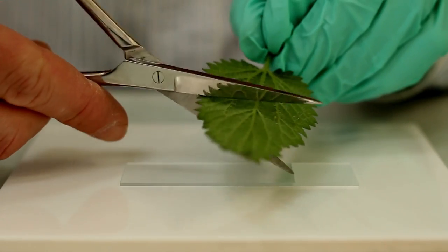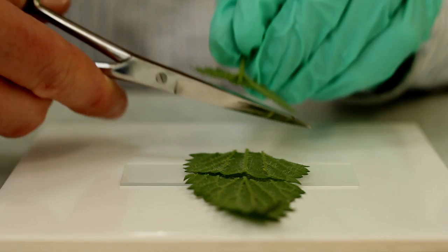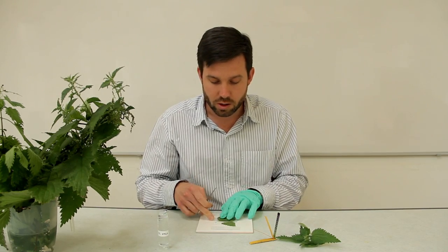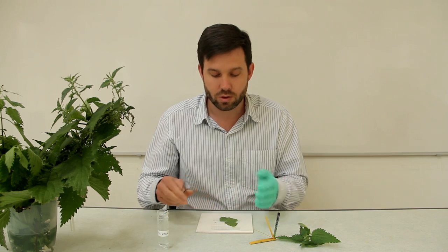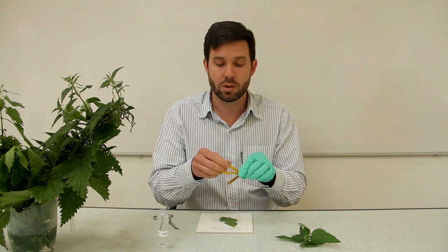You take a slice of your stinging nettle leaf on your slide — and I'm wearing gloves to do this for obvious reasons — and you put the lowermost surface of the leaf facing you on the slide.